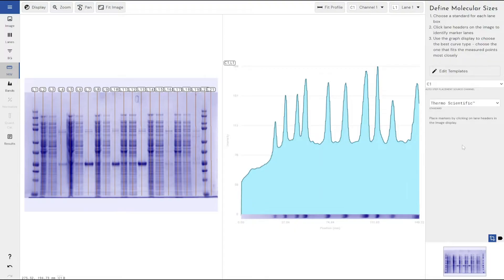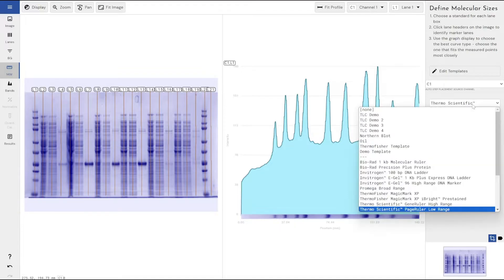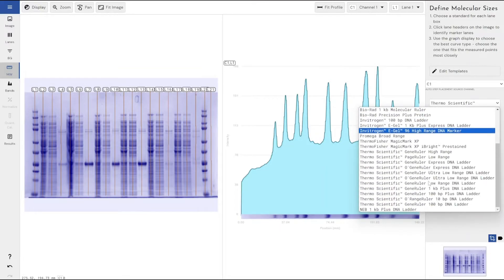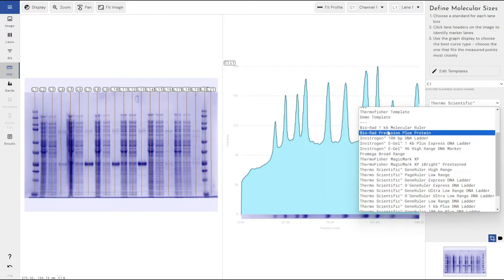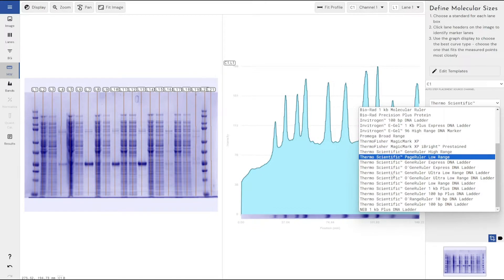Within our Phoretics 1D software, we have a number of pre-built molecular weight templates, a number of known standards. We've got some from Bio-Rad, Invitrogen, Thermo Fisher, Promega, NEB, those kind of people.